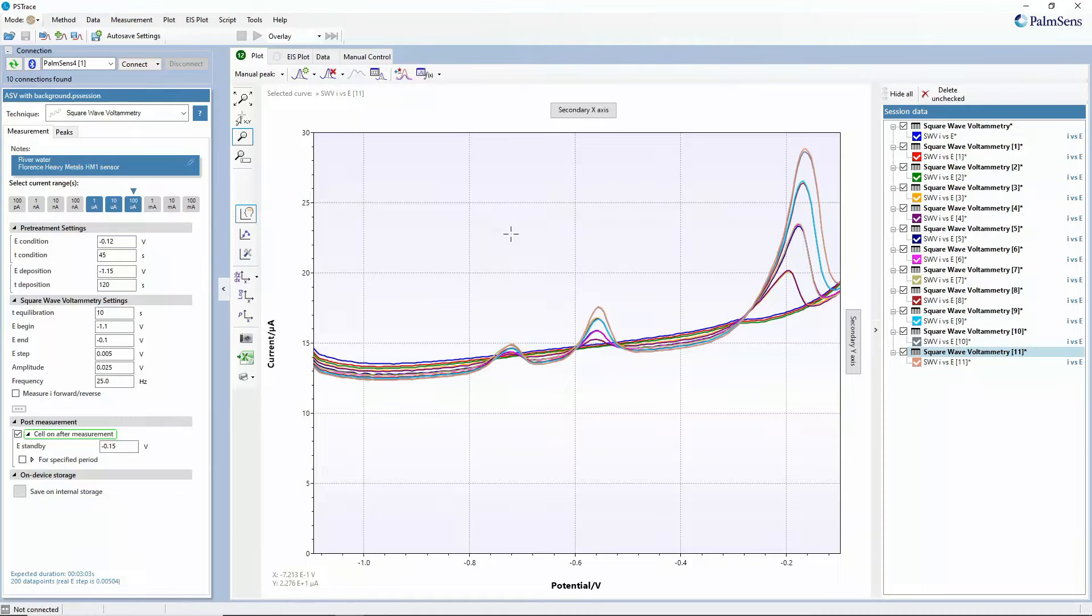Hello and welcome to this PS Trace tutorial video. Today I would like to show you the curve operations window that gives you a few opportunities to actually process your curves inside PS Trace. So without further ado, let's have a look at that.